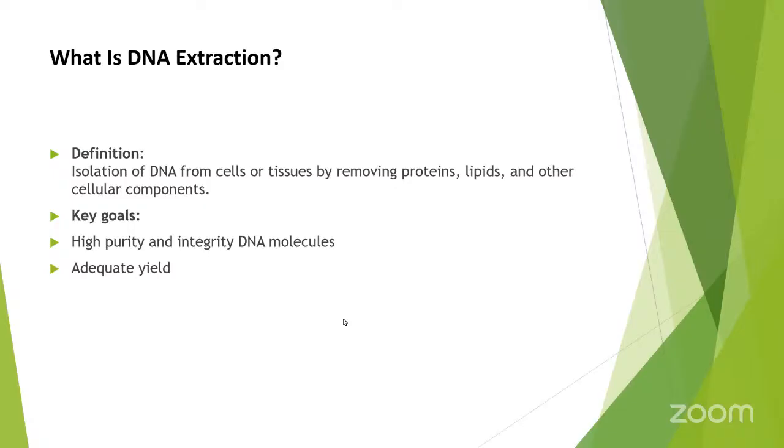What is DNA extraction? Let's look at the definition. It is the isolation of DNA from cells or tissues by removing proteins, lipids, and other cellular components. The key goals are that we need high purity and integrity of DNA molecules, and also adequate yield.